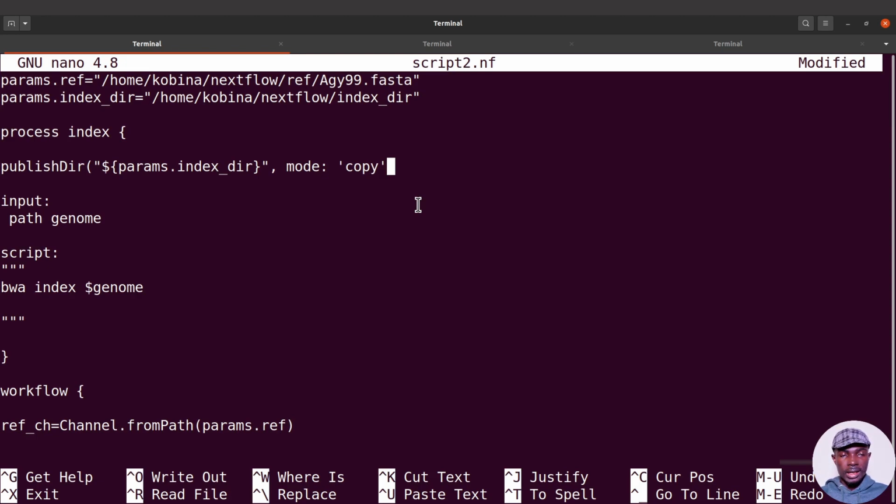That's fine. That's up to you. But for now, let's stick to copy. So now let's end it. Let's close the parentheses. So that's it.